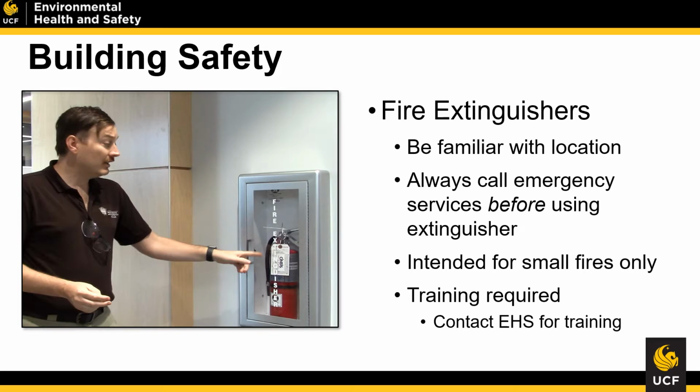At UCF, as you can see, each fire extinguisher usually is located within a pull box. Those pull boxes are actually not alarmed, so if you were to open one and remove the fire extinguisher, an alarm would not sound. In the event that you're using a fire extinguisher, most likely you have a fire. Please make sure that in the event of a fire, you call 911. If for some reason you call 911 and you don't get UCF dispatch because we are in the greater Orlando area, just tell the dispatcher that you are at UCF and would like to speak to UCF Police Department so that way we can have the appropriate fire department respond.